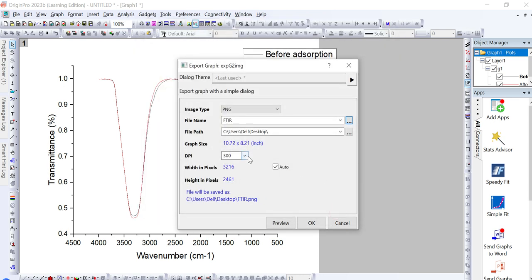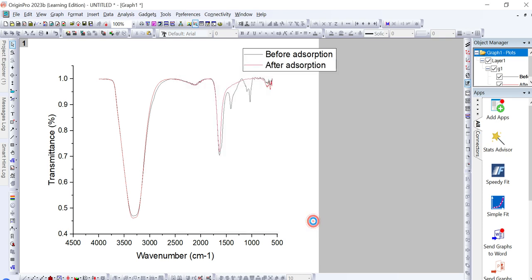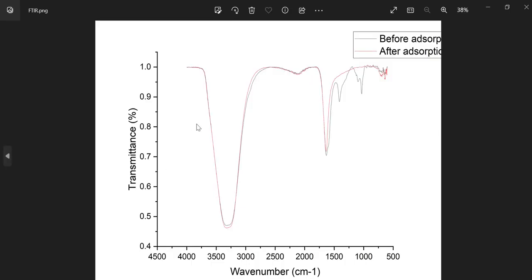You can also select the DPI — for example 300, 600, or 900. Select 300 and then click OK. The FTIR graph will be saved to the desktop folder with the name 'FTIR.' Click on the saved file to verify the FTIR graph plotted in OriginPro has been exported correctly.